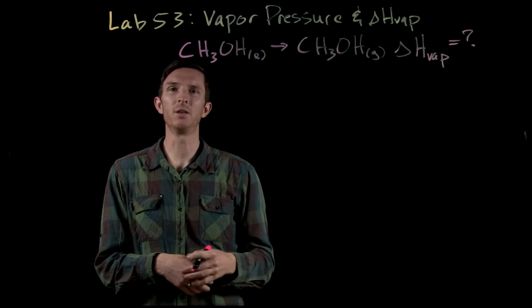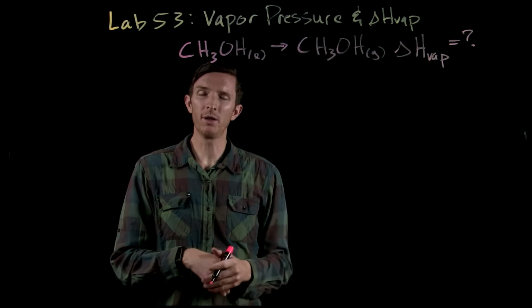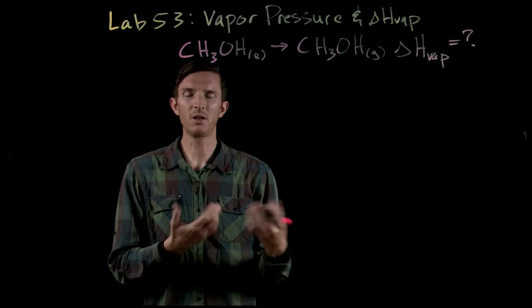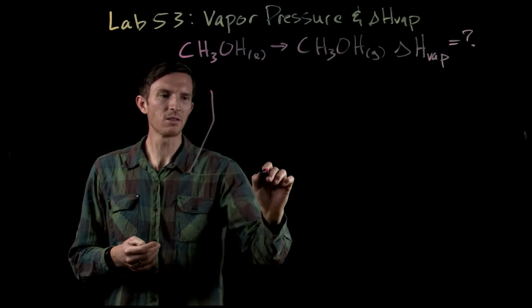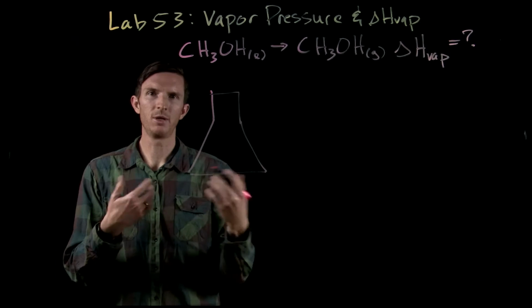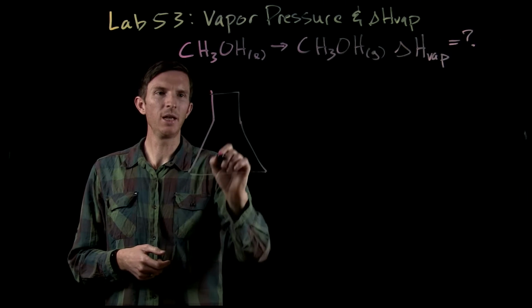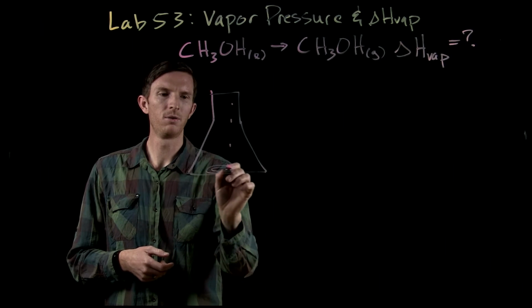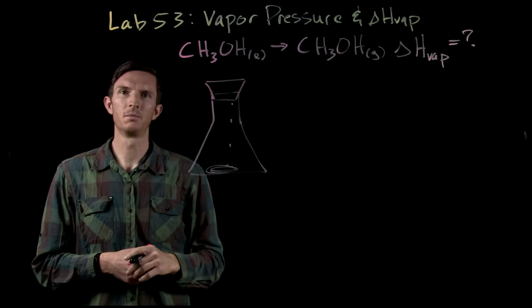And we're going to do that not by looking at how much energy we have to add to make something evaporate. We're going to look at how this information relates to its vapor pressure. So let's talk a little bit about vapor pressure, okay? Let's say we have a flask, like you guys are going to be given in lab, and into that flask we have just air, okay? Well, we can then add a few drops of maybe methanol or ethanol, and then we'll cap that off, okay?